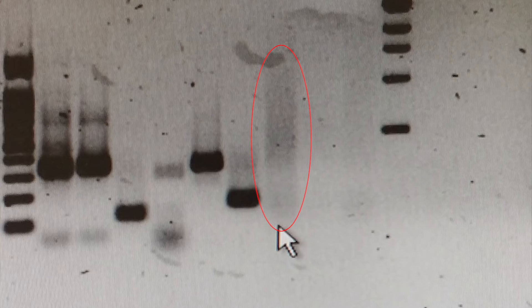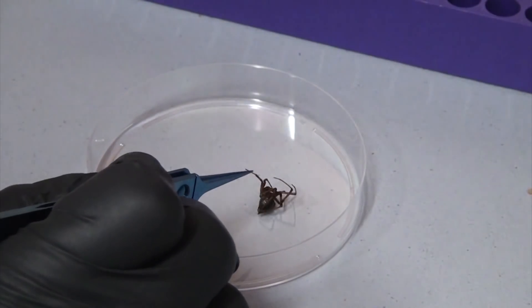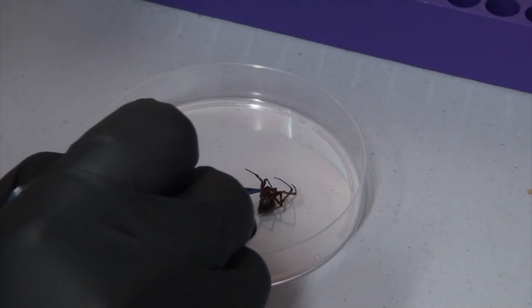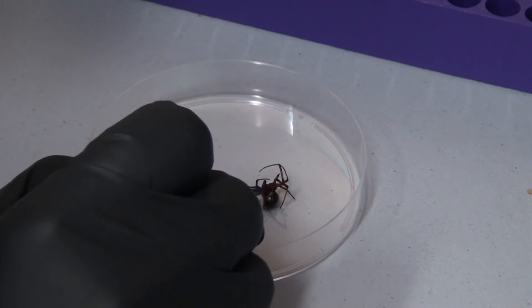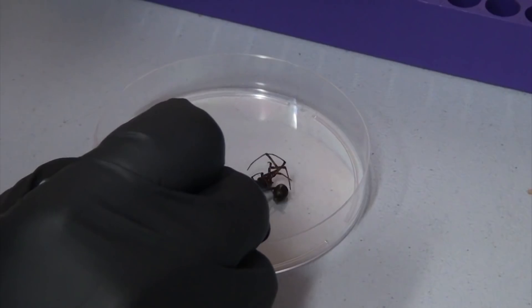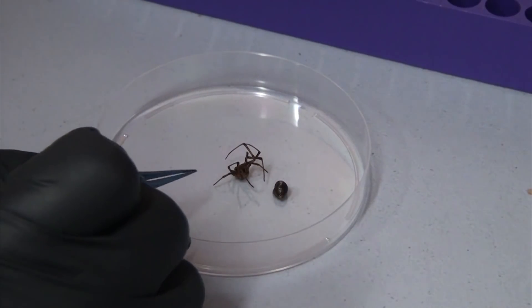This actually matches up with an earlier result where we managed to get a whiff of spider DNA, but at the time assumed it had just been damaged by the extraction protocol. Now the running hypothesis is that the ethanol preserves the spiders and prevents them from rotting, but it doesn't stop the spider's native enzymes from destroying the DNA. And this kind of makes sense. When I cut into the spiders, they were mush on the inside, meaning everything was damaged.